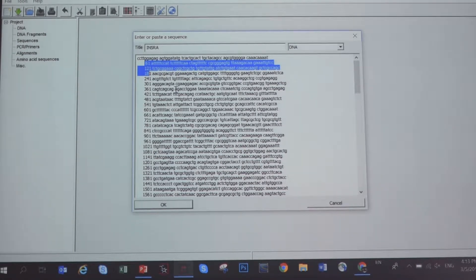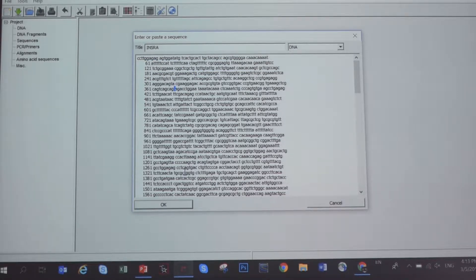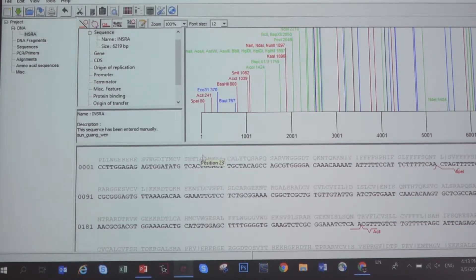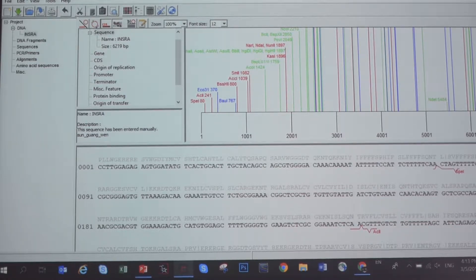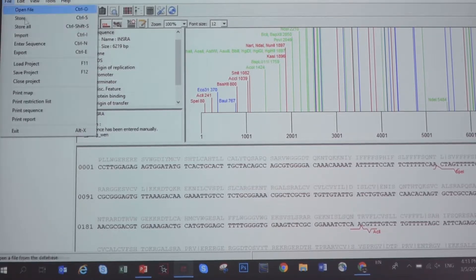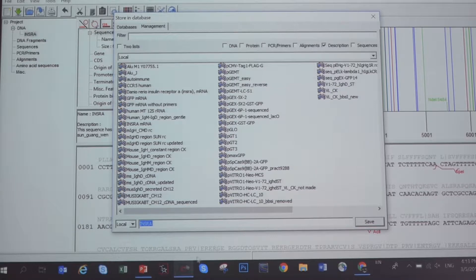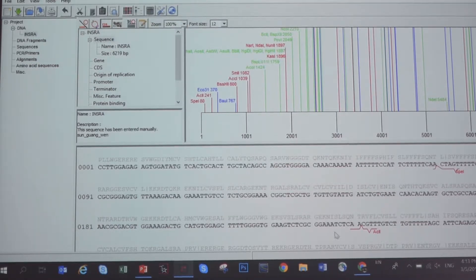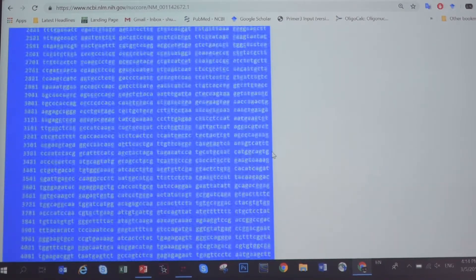As well as spaces between the nucleotides. Once you're ready, click OK. You can see the sequence — the name here has an asterisk, which means that changes made cannot be saved directly. So you can click 'Store' to save the sequence.